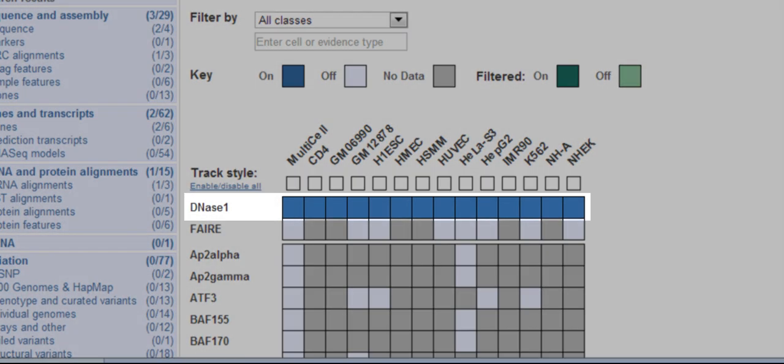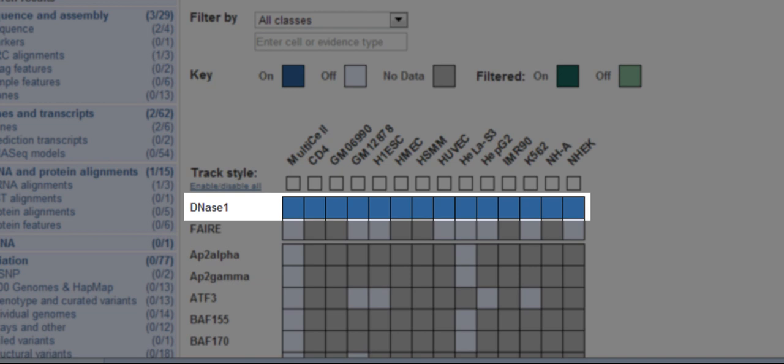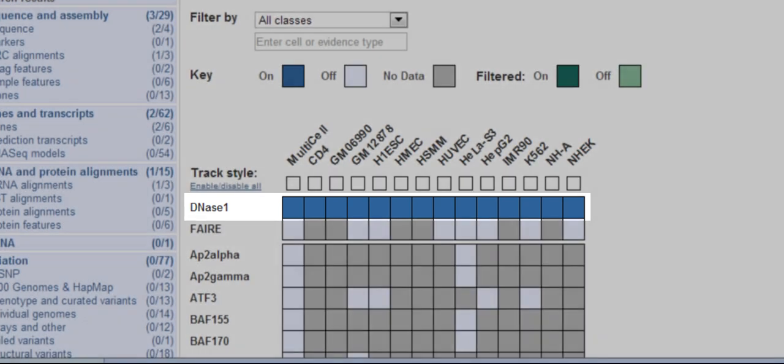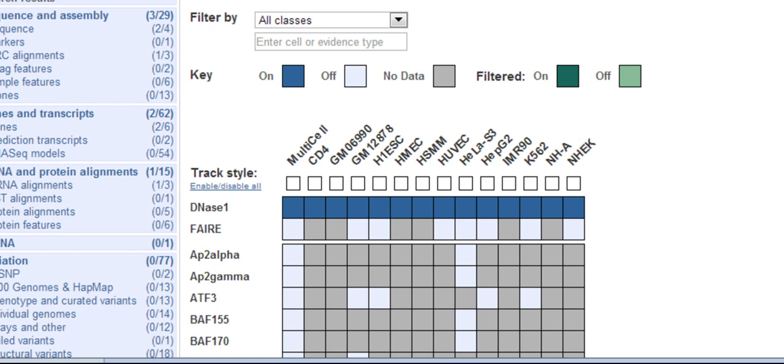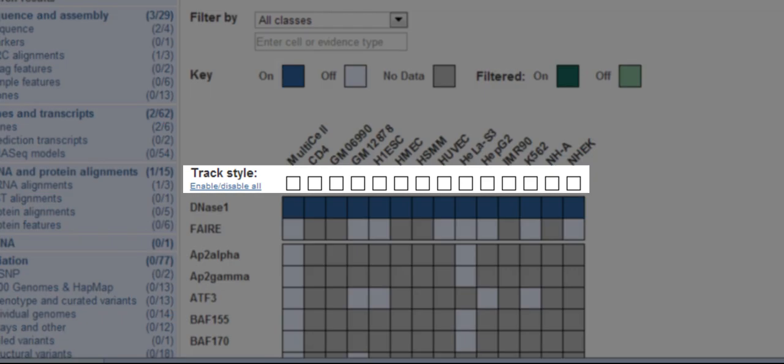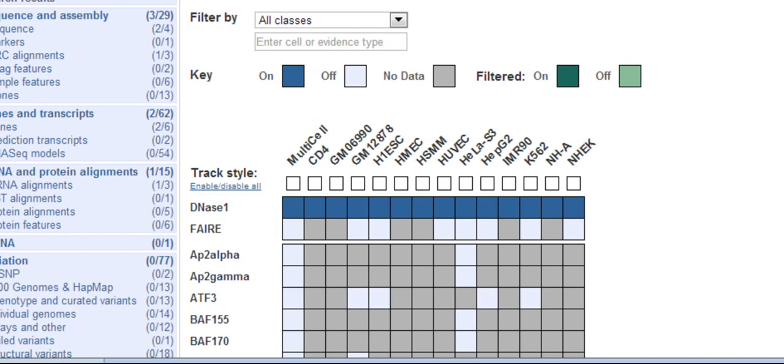By default, all the DNase1 hypersensitive sites are turned on for all cell types, but does that mean they are shown automatically in the region in detail view? No. To show the data in region in detail, I have to choose either the multi-cell option or an individual cell type.